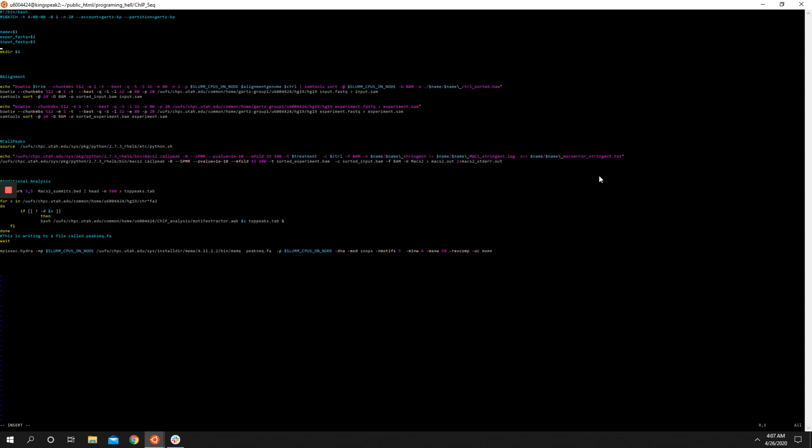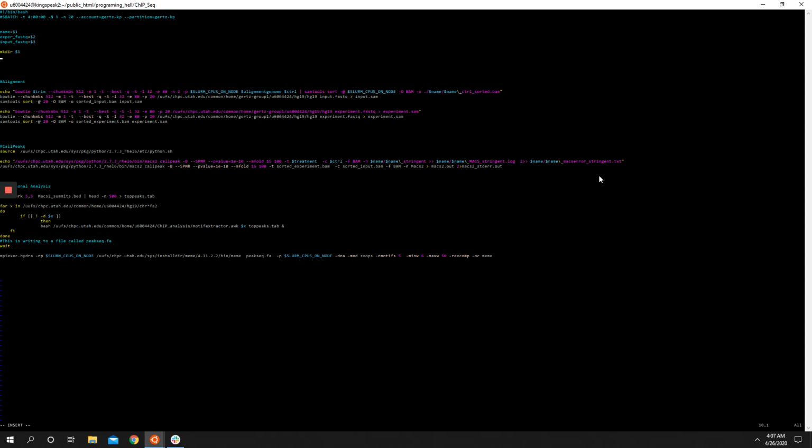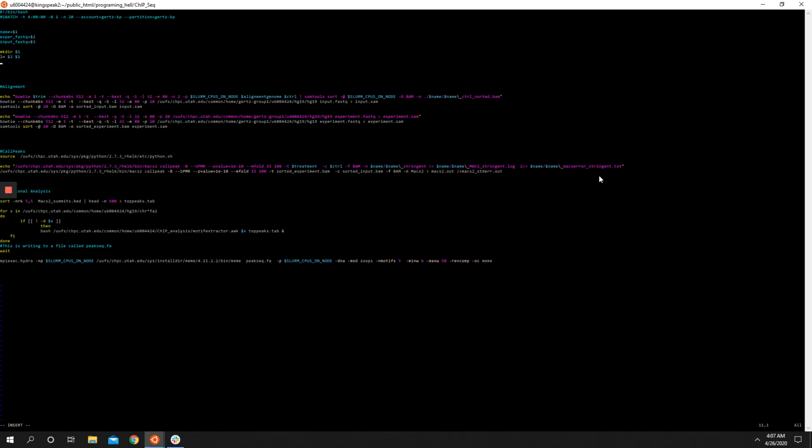So what we're going to do, just to keep everything in one spot, is link $2 into $1 and link $3 into $1. So essentially, let's do this: $name.